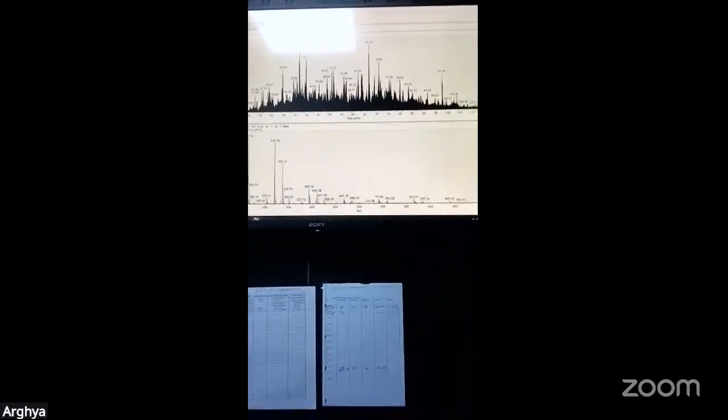Like you can find, this is a 120-minute gradient. Each MSMS peak corresponds to more than 2 MSMS. And here you can do both targeted as well as global proteomics, and you can find your best interactors which are inside.